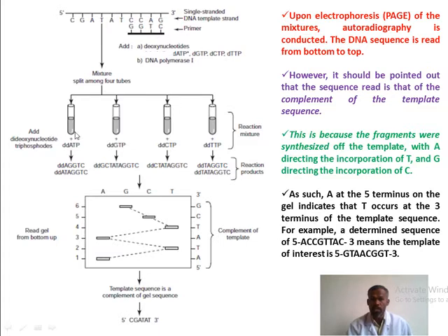So the polymerization occurs, and the DNA polymerase adds deoxynucleotides as well as dideoxynucleotides. Wherever a dideoxynucleotide is added, the DNA polymerase stops. The DNA replication stops. Then they will make different sizes of DNA fragments. After that, you run a polyacrylamide gel, where we can run the DNA, which separates the DNA by size.